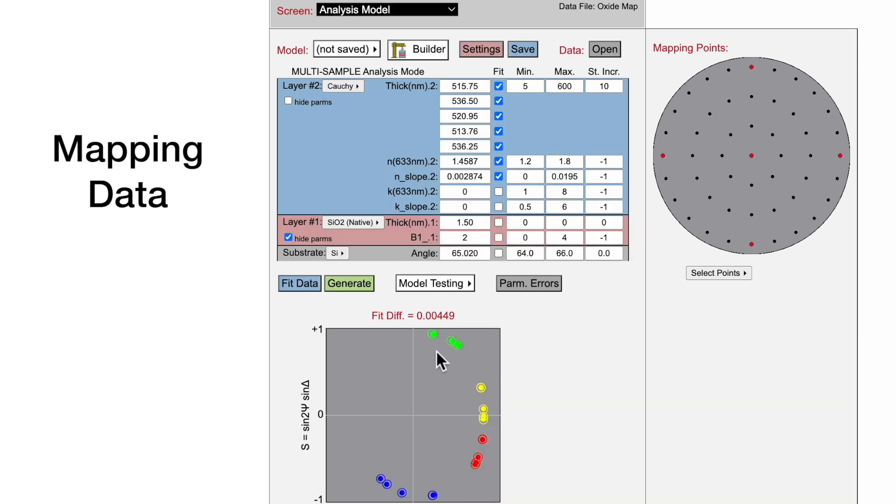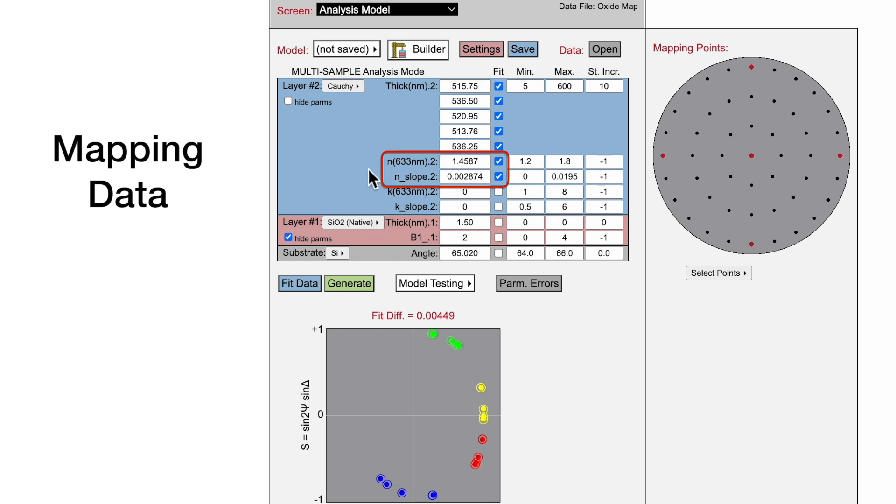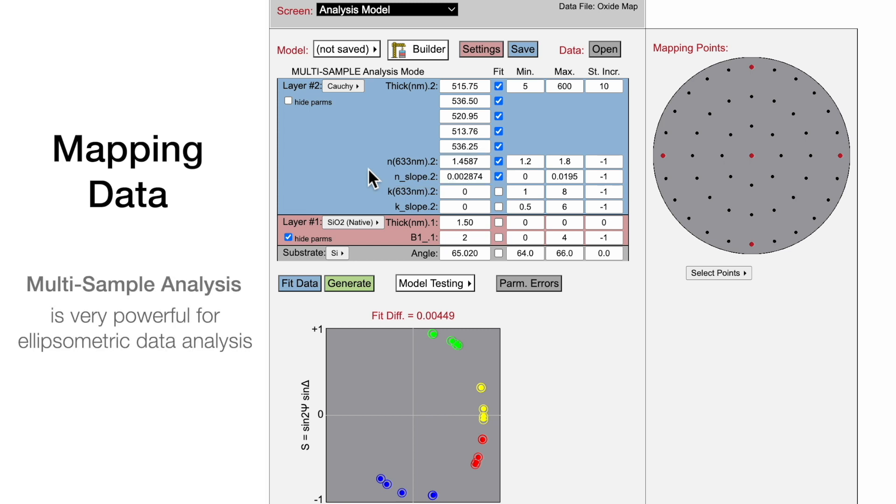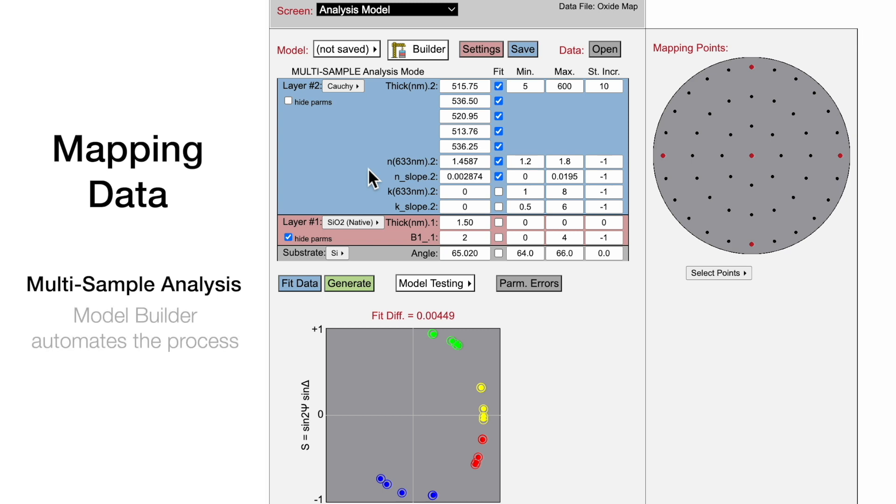Note the multiple sets of ellipsometric data shown in the plot, which correspond to different film thicknesses across a sample. The optical constant parameters are assumed to be the same at each measurement location. Including multiple ellipsometric data sets improves the accuracy of the determined optical constants, which is especially helpful when characterizing absorbing films. And Model Builder can help automate this powerful analysis.